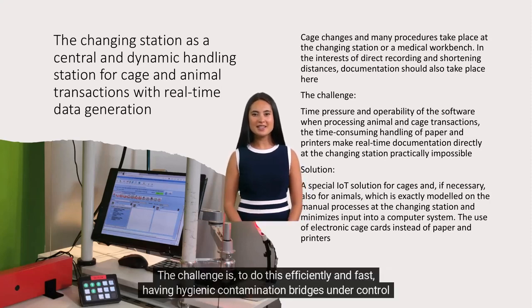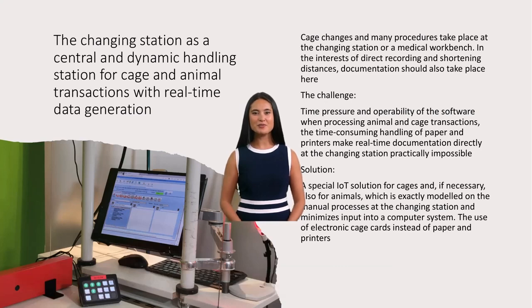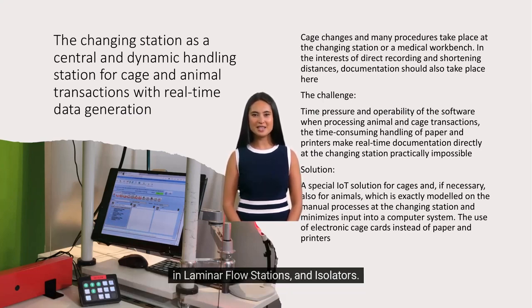The challenge is to do this efficiently and fast, having hygienic contamination bridges under control while doing physical transactions with the cages and animals. This is the reason why we develop software and tools to do these updates as simple and as hygienic as possible in laminar flow stations and isolators.